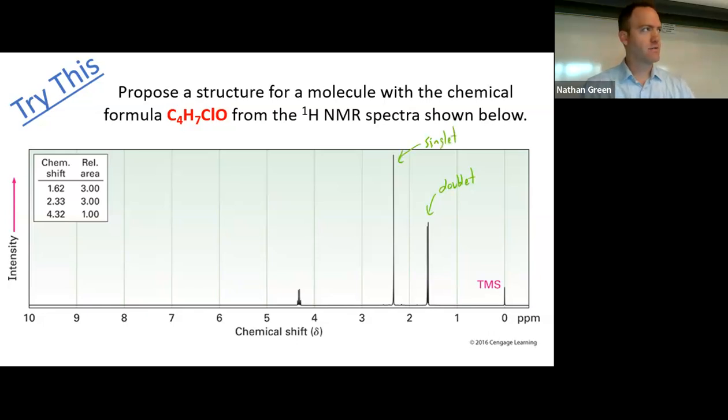And the hardest one. So if you're in the room, that's maybe really hard to see, although I'm seeing a lot of squinting. Anybody here want to take a stab? What's the nature of that peak? That is a quartet. Very good. That's not how you spell quartet.